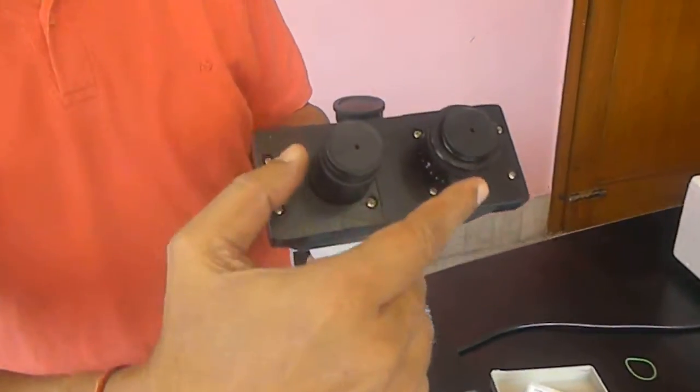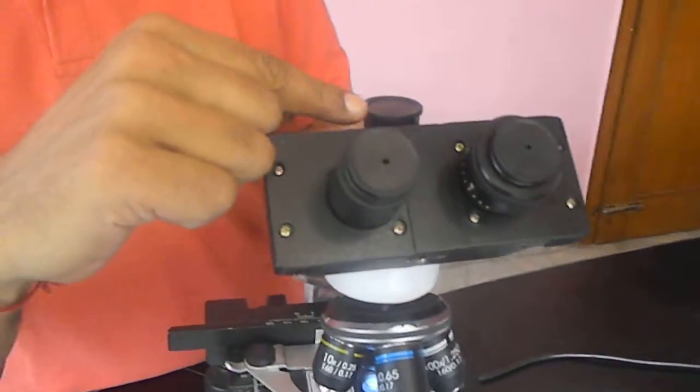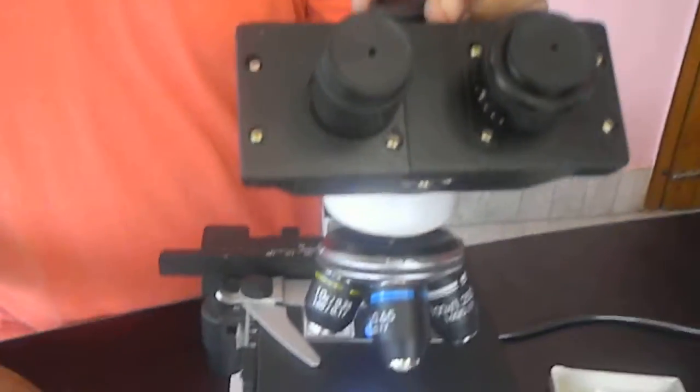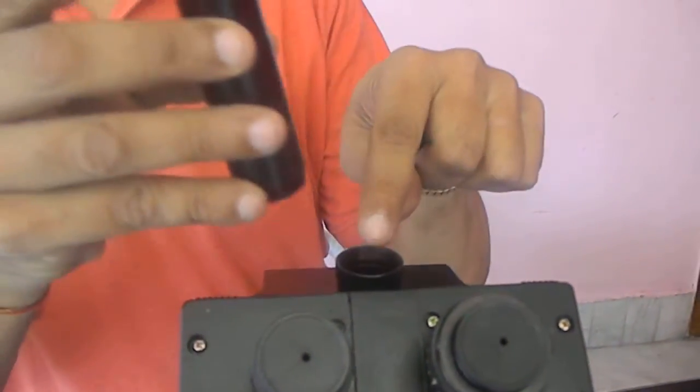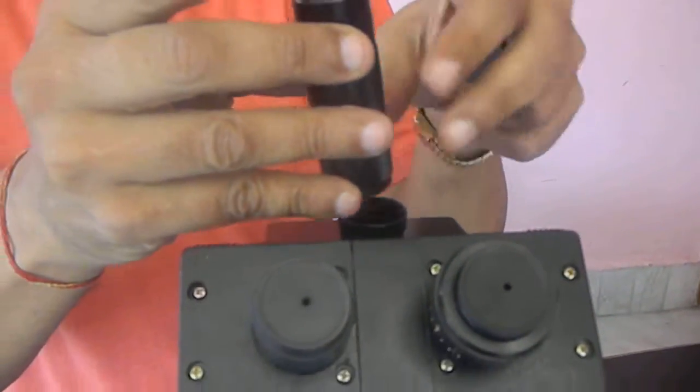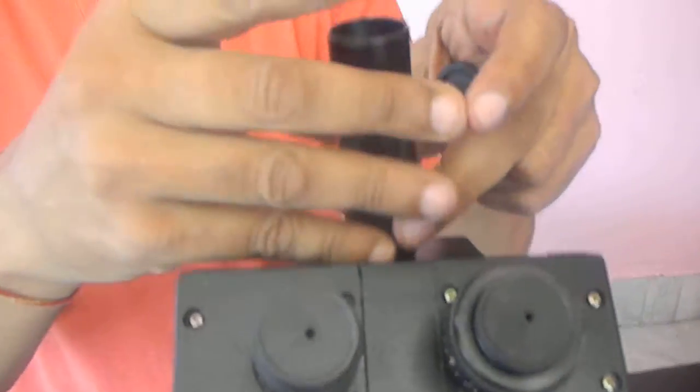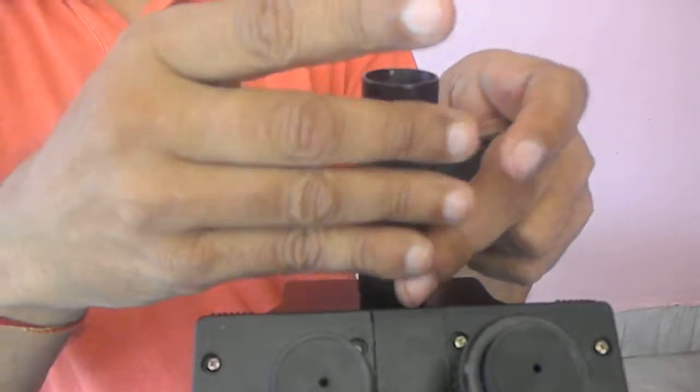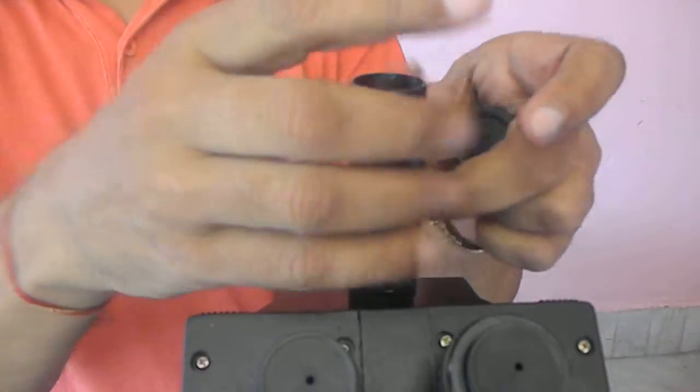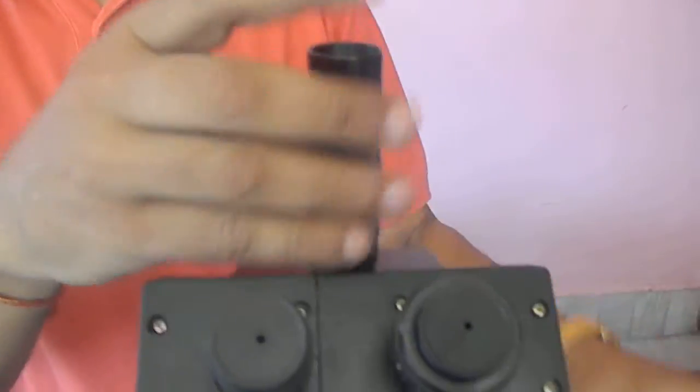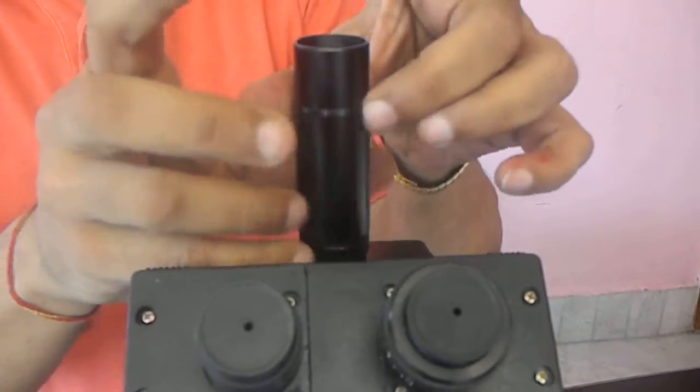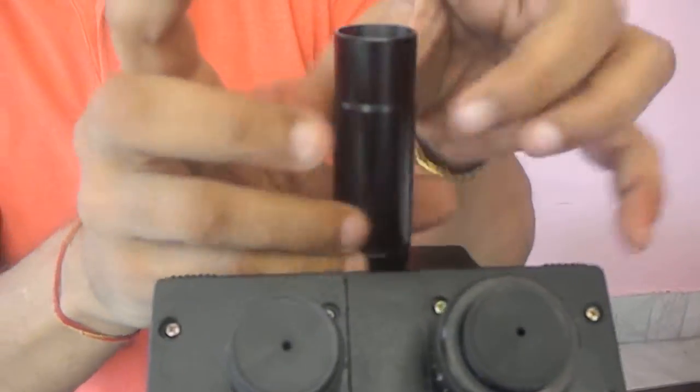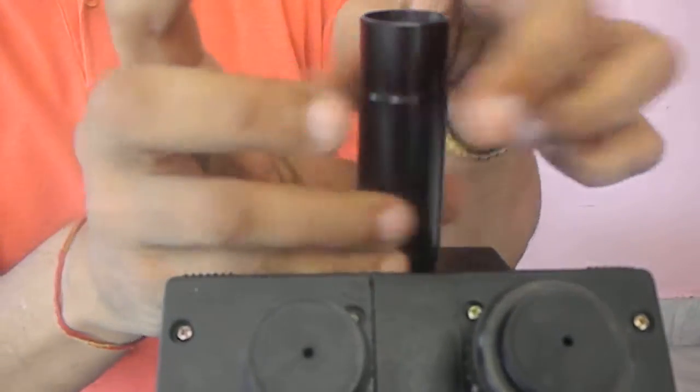It has the eyepieces, one tube which is a vertical tube for camera. We are putting it here and then this is very easy. Just rotate it, fix it and it becomes a vertical tube.